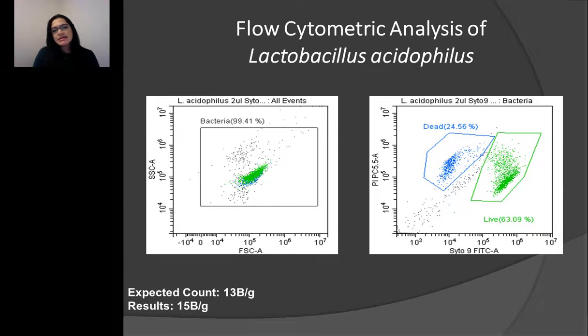This is expected because, depending on the raw material sample that we are prepping, there is a cryoprotectant covering these cells. This is just part of the freeze-dry method that these cells go through before we get them into our lab or into our company in powder form.